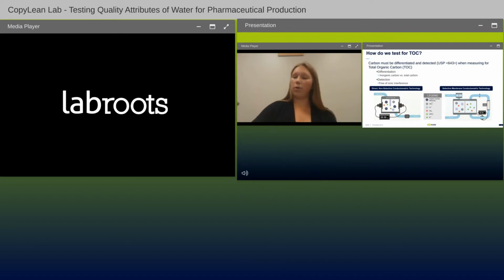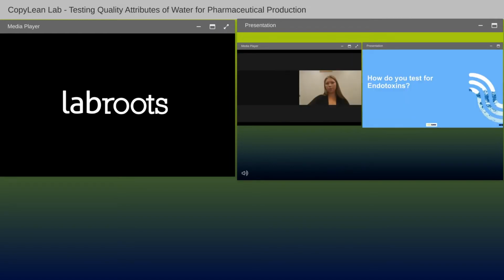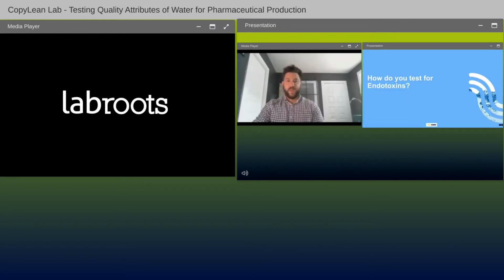So now that we've gone through how to test for conductivity and TOC, Hayden, can you share a little bit more about how we test for endotoxins? Thank you, Kaitlyn. So I will go ahead and discuss how we test for endotoxins currently in the industry.